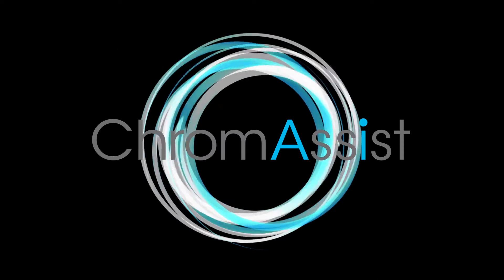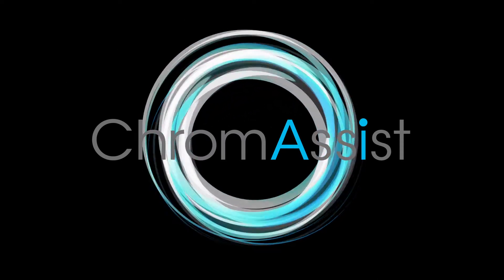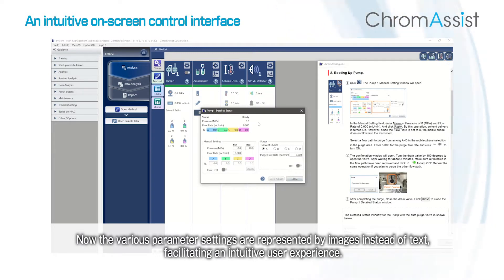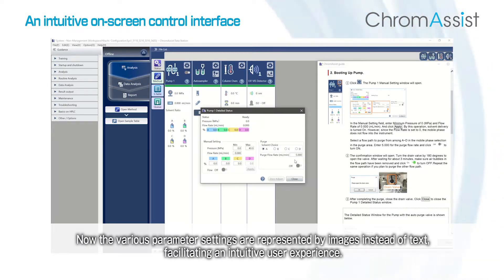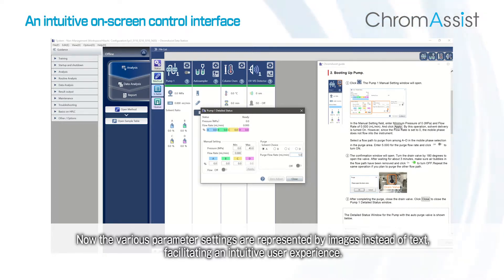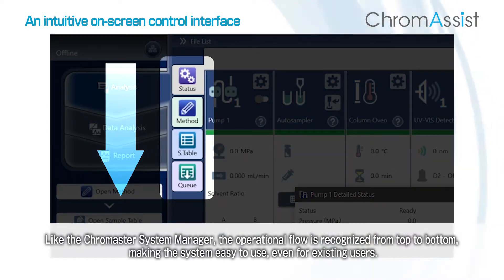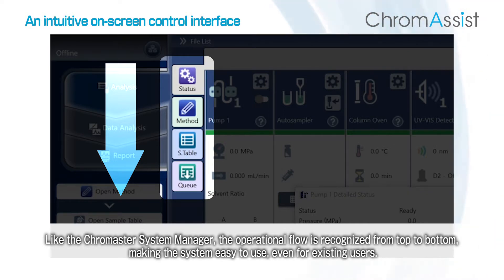ChromeAssist redefines the on-screen control interface. The various parameter settings are now represented by images instead of text, facilitating an intuitive user experience. Like the Chromaster System Manager, the operational flow is recognized from top to bottom, making the system easy to use even for existing users.